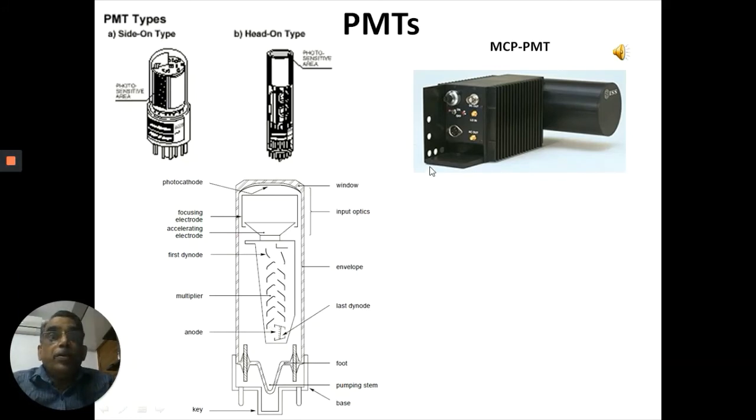The next level of PMT is the MCP-PMT, which can be used for time measurements. The time resolution, as we said, the time response is also important. Time resolution decides the application towards time-resolved measurements in fluorescence spectroscopy. The MCP-PMT is used for TCSPC fluorescence lifetime measurements.